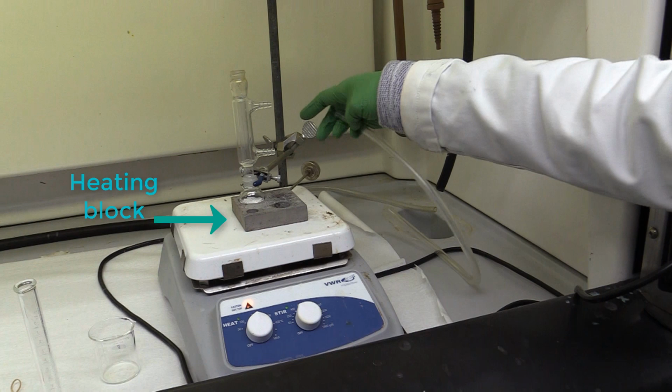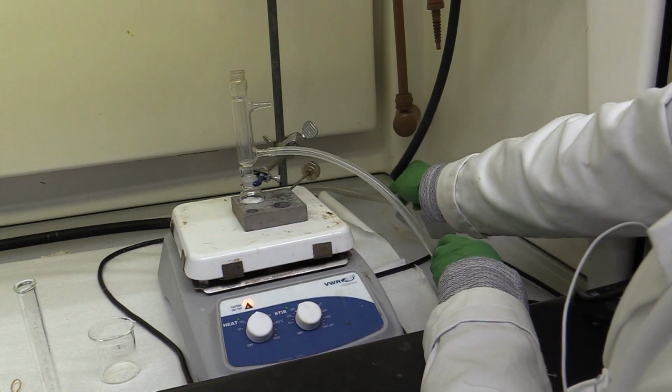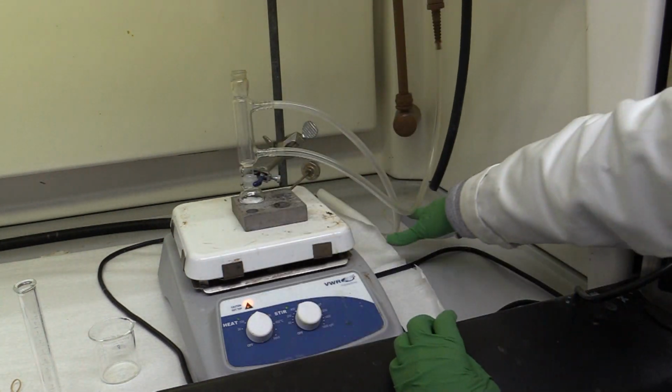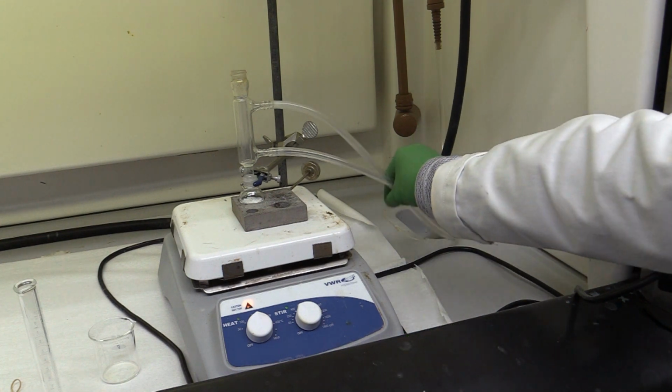Place the round bottom flask in the heating block on the hot plate. Connect a hose from the bottom port of the condenser to the water. A hose should also be connected from the top port that leads to the drain in the hood. Make sure it sits in the drain or you will have a big mess.